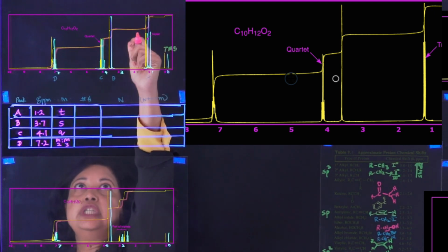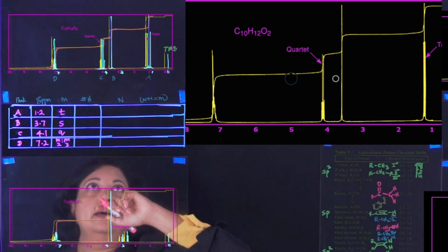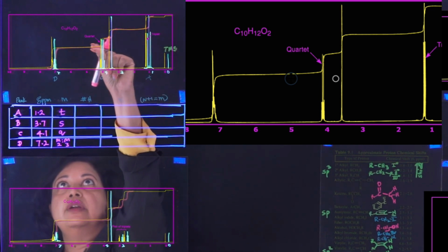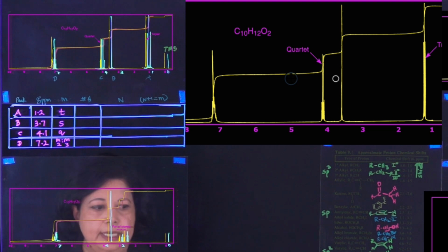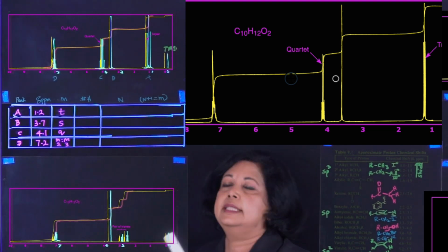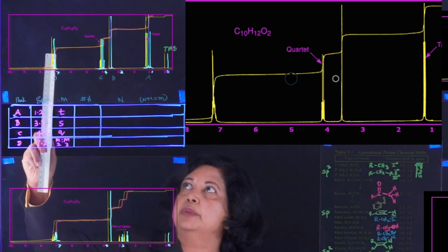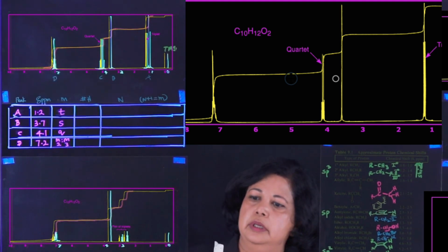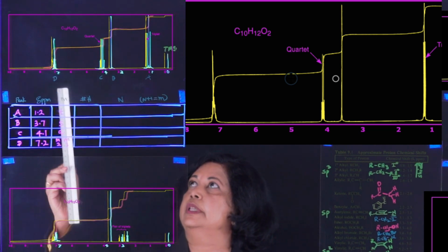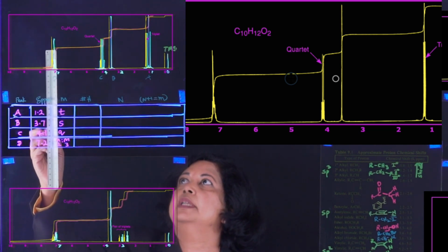Number of hydrogens. Over here, we do have to measure the distances and then put them in here and see how it is. Okay, so let's do the heights with a ruler. So grab our centimeter ruler and see the height ratio for this. This is 2, this is 3.